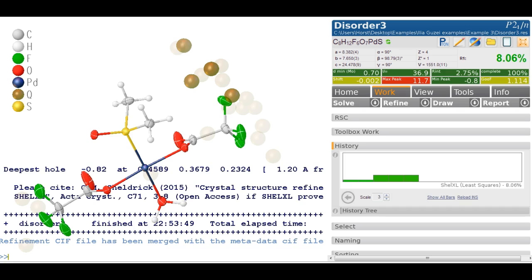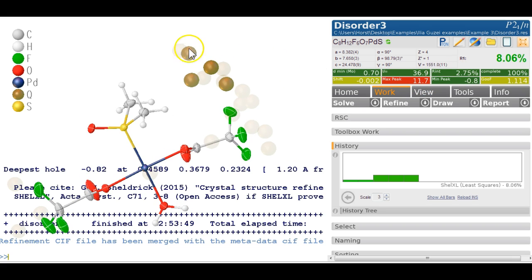Let's have a look at this example. It is an example of a disorder across a symmetry element — a common case and typically quite difficult to deal with — and I'd like to show you how you can do things fairly easily in OLEX2. We've got a good data set: high resolution, very strong data, good Rint. The final R-factor is eight percent and the biggest peak is 11, so there's clearly something missing, and that's visible here.